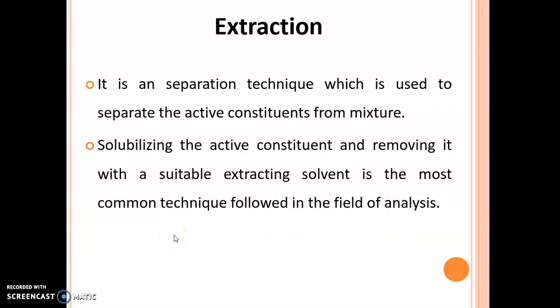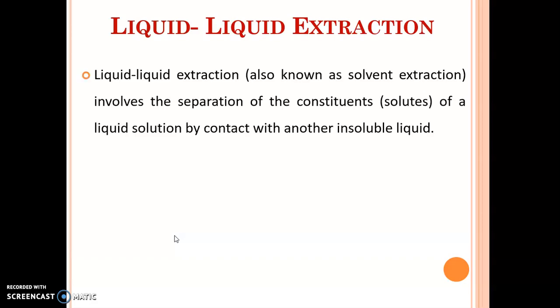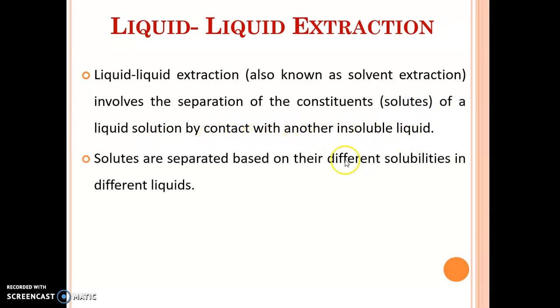Now let us start with the main part of our method, that is liquid-liquid extraction. Definition of liquid-liquid extraction technique. This method is also known as solvent extraction, which involves the separation of the constituents or solutes of a liquid solution by contact with another insoluble liquid.